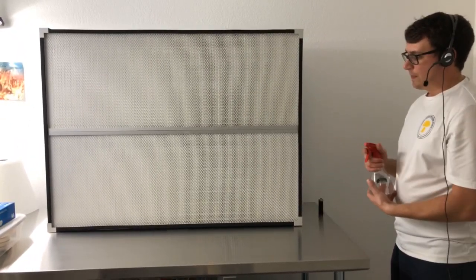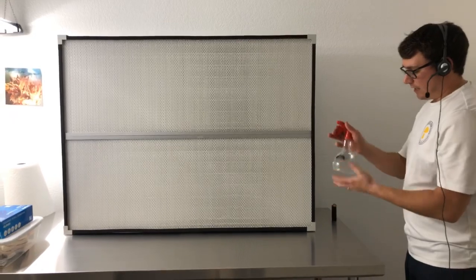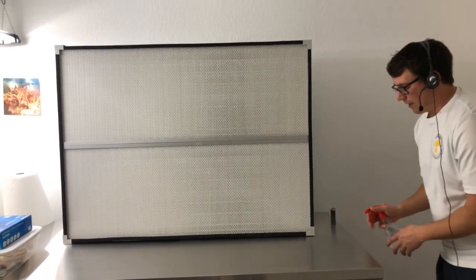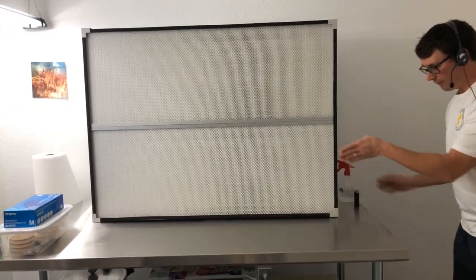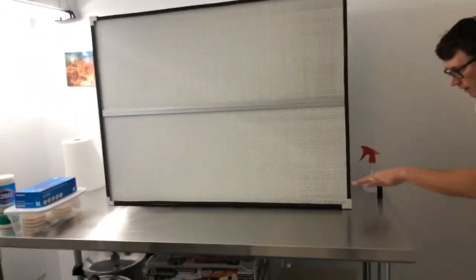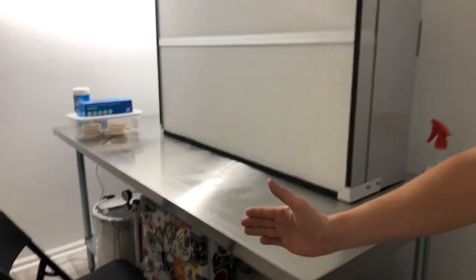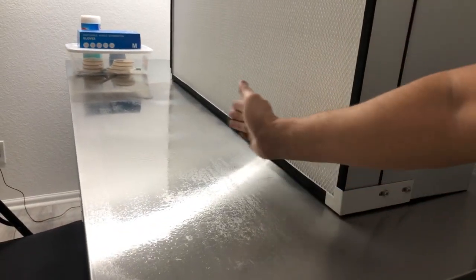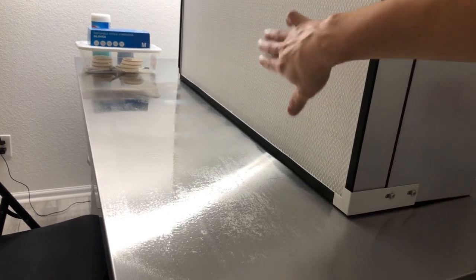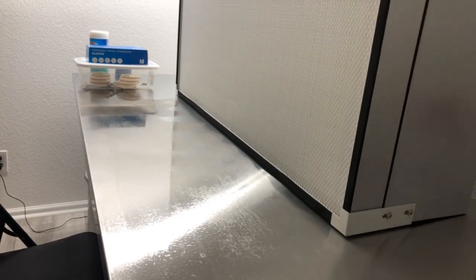Another trick you can do to ensure that your filter is working properly is take isopropyl alcohol and spray it on the surface. If you come from the side, you can watch the alcohol evaporate from where the fan is towards the edge of the table. You can see the different streamlines where the alcohol is evaporating, which indicates that there's a good laminar flow.